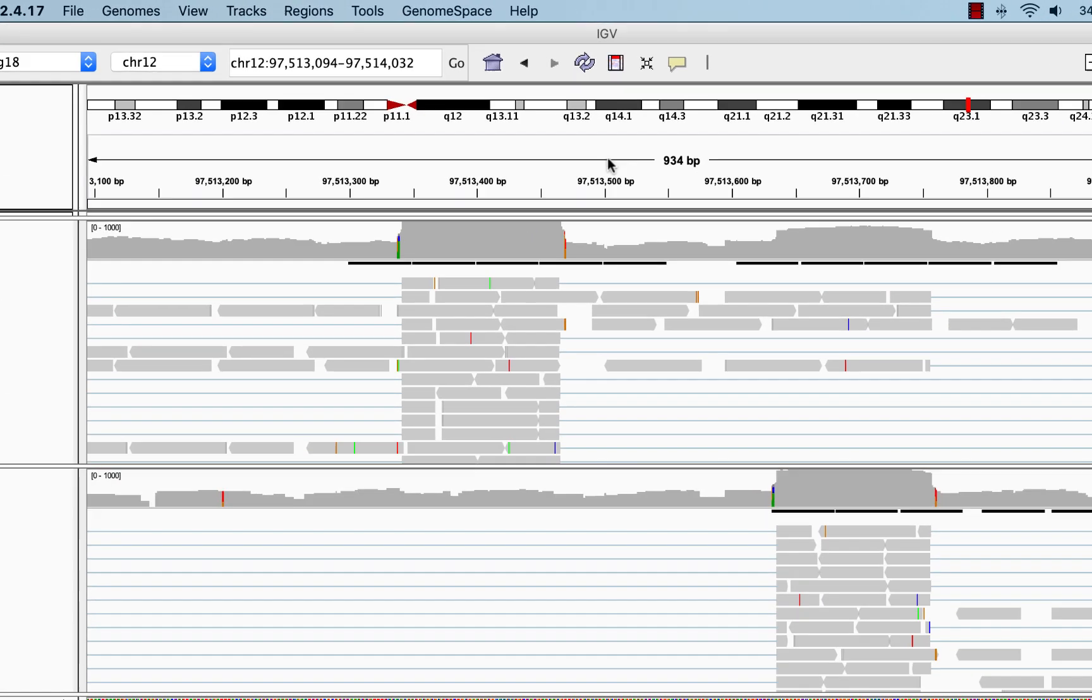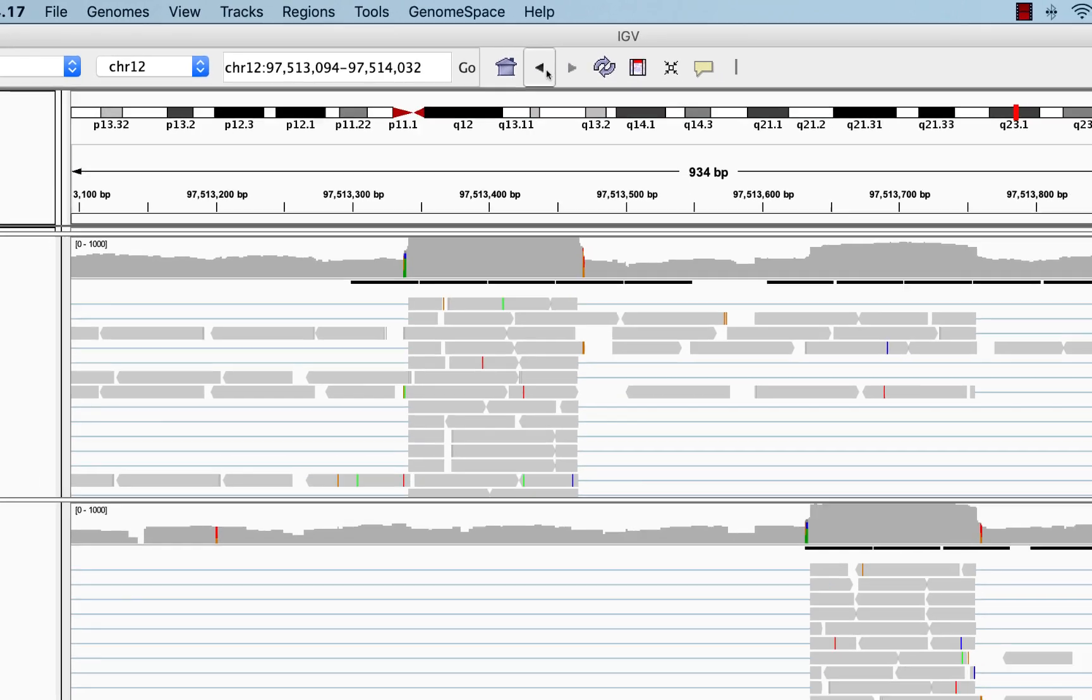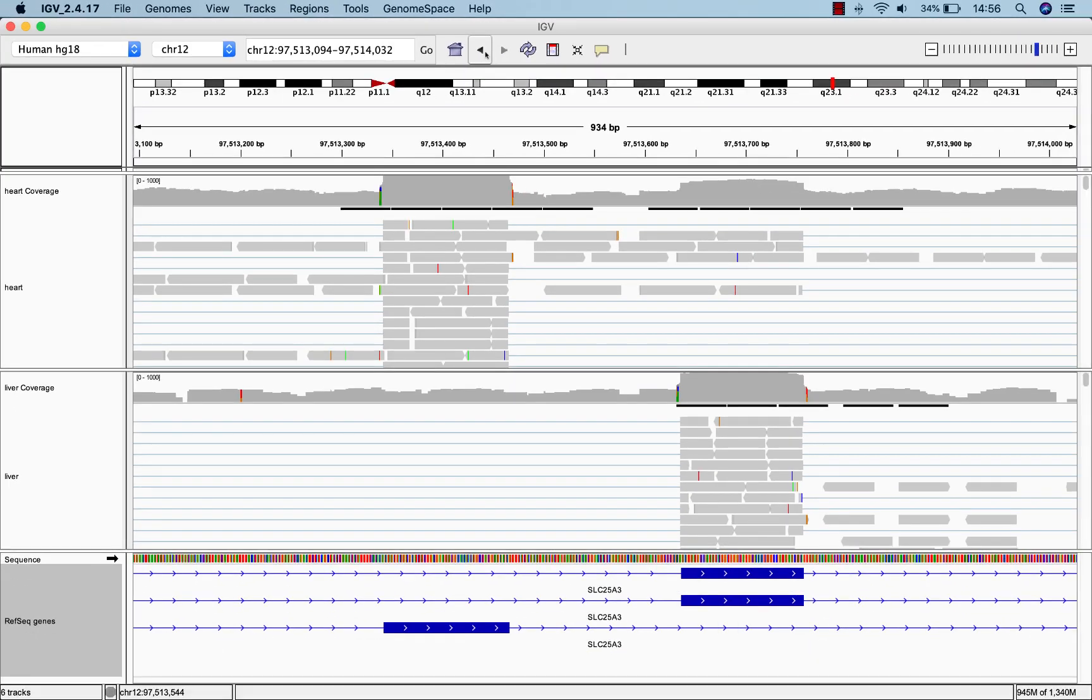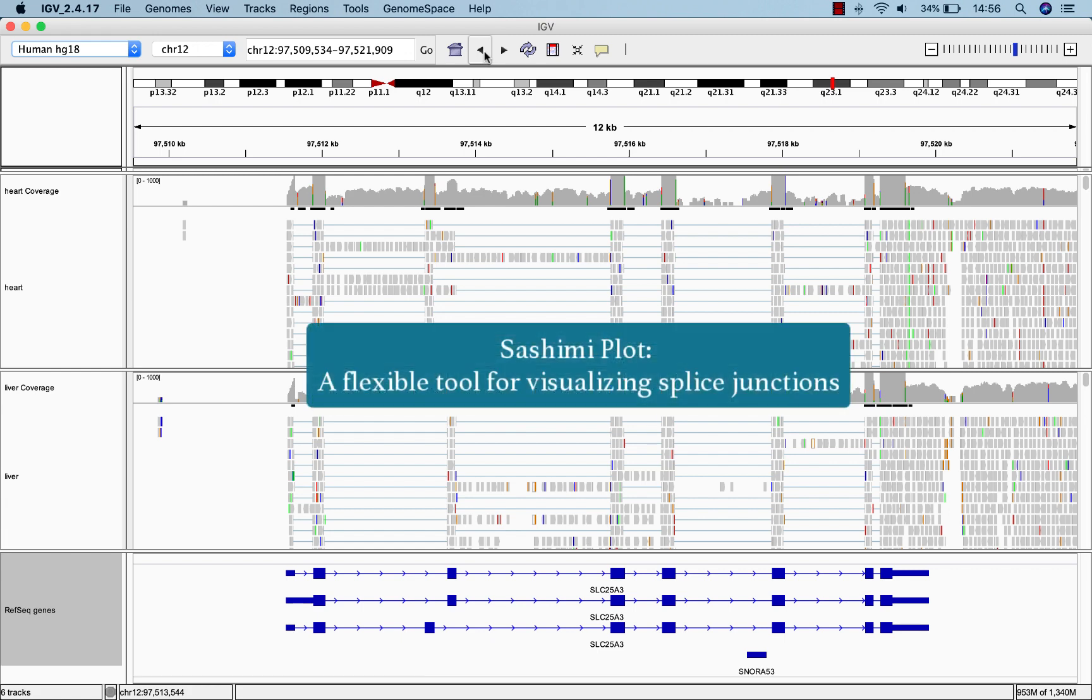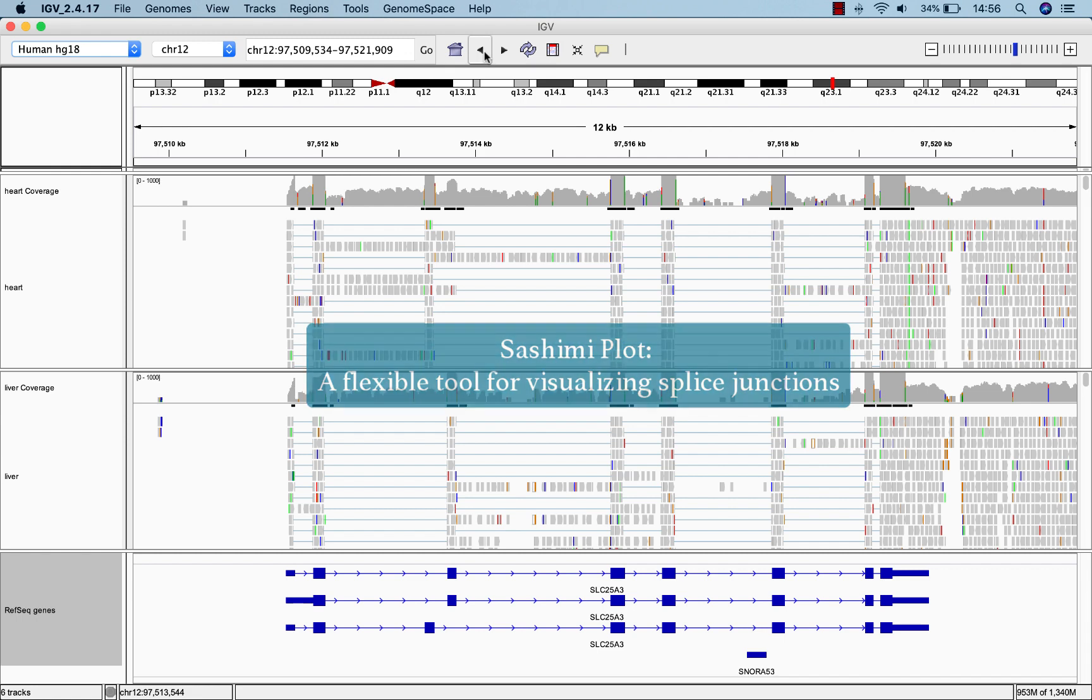Let's return to our previous window using the back arrow. To better visualize the effect of splicing on the expression of this gene in heart and liver, we're going to use a sashimi plot. You can think of a sashimi plot as a more flexible version of the splice junction track.